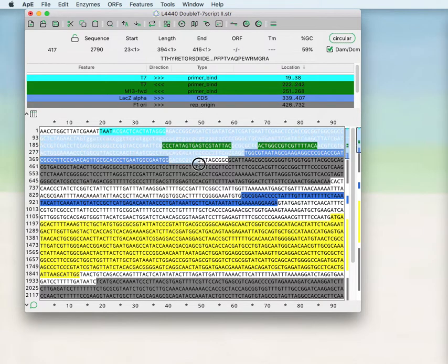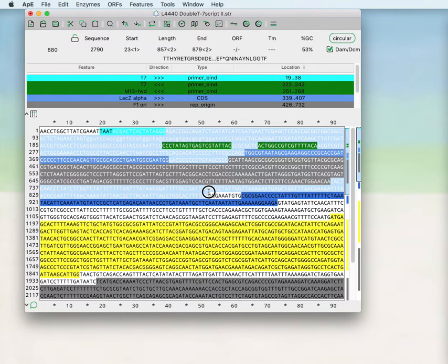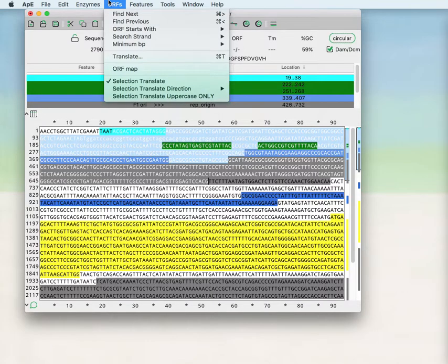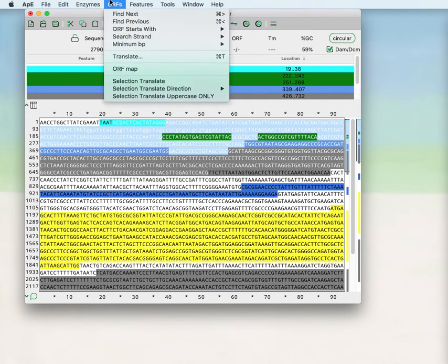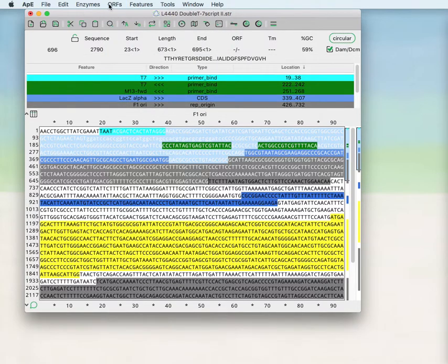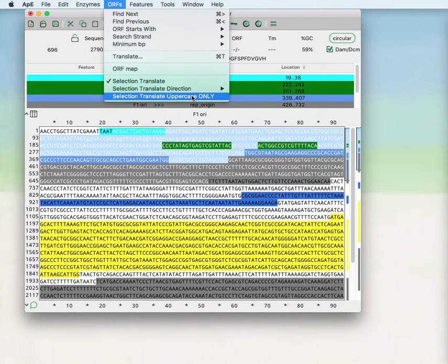You can translate the selected region live and that's shown here or you can turn the translation off. If you turn it on you can choose to translate in the forward or reverse and then you can also translate uppercase only if you wish to ignore any DNA sequences in lowercase.